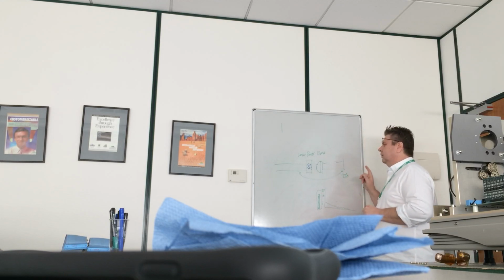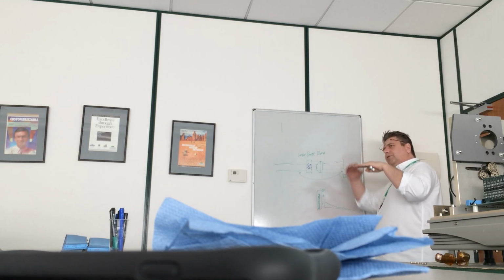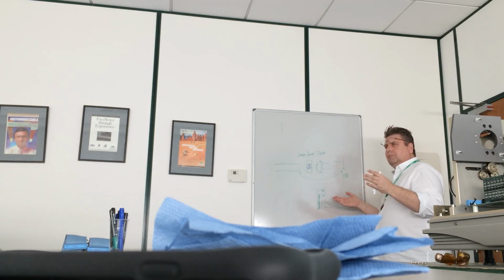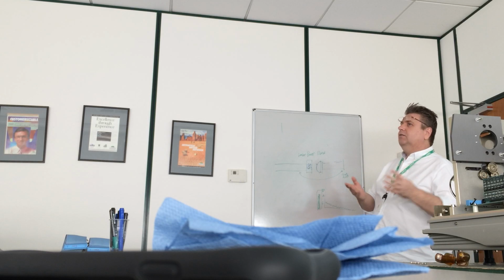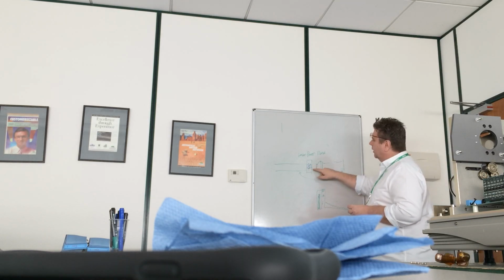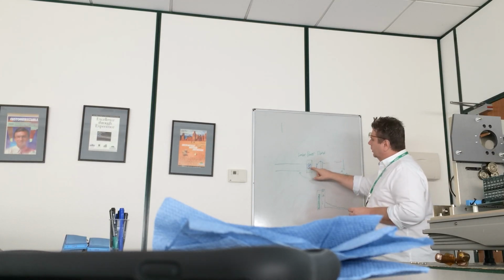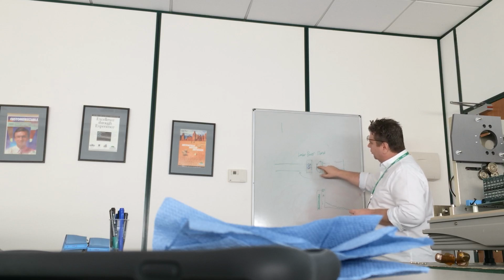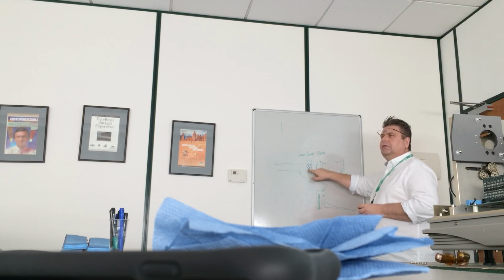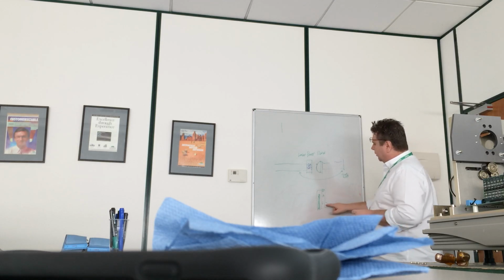But what happens in the software? The software measures the background, then it measures the sample, and then subtracts one from the other, yeah? Yeah, that's exactly, all systems do exactly the same thing. But when you've got the sample in there, remember this background, this contamination we measured right at the very beginning. This contamination on this lens here is not going to see as much laser light because now we're blocking that background noise by particles.